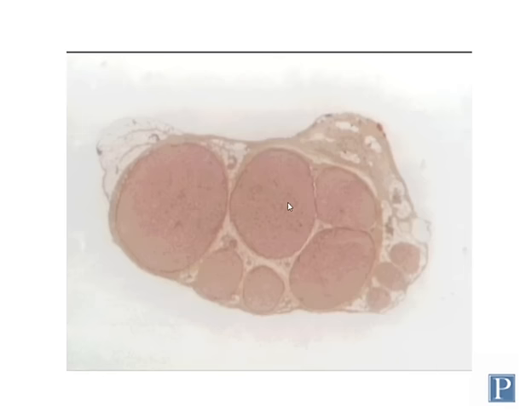This is a cross-section through a nerve, so now we're looking at structures associated with the peripheral nervous system, which is composed of nerves and ganglia. So this is a cross-section through an entire nerve, and nerves contain axons that are wrapped in various connective tissue wrappings. So there are three major connective tissue layers or wraps that surround the axons that you need to know.